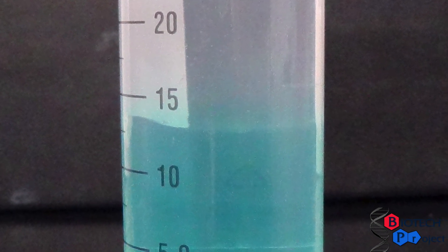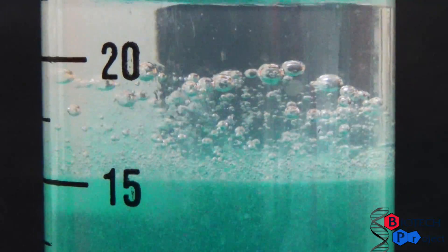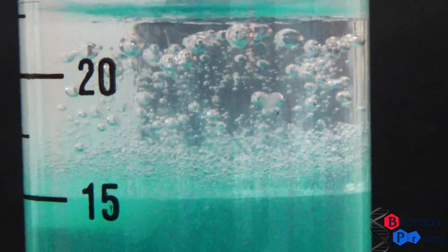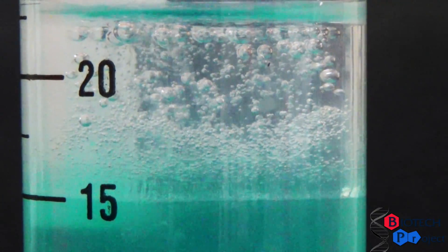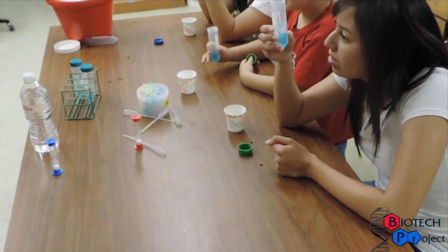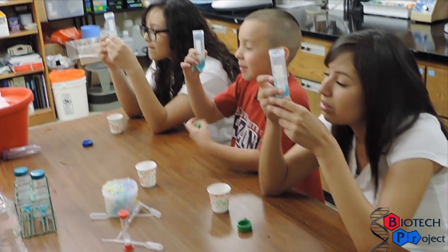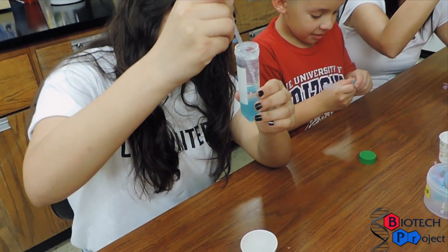Notice that the ethanol forms a layer on top of the detergent layer. It is important not to mix these two layers. Upon adding the cold ethanol, bubbles become visible where the layers meet. The DNA will appear as a white, thread-like material between the bubbles. This process can take anywhere from one to two minutes.